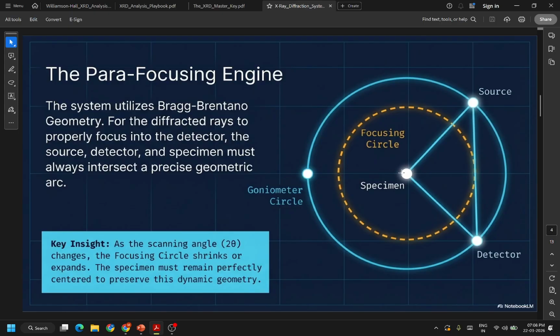force light at a very slanted angle, so that your X-ray beams don't go much deeper because they are slanted. They go like this instead of like this, so they don't go deep into your substrate, so your peaks from the substrate do not come.